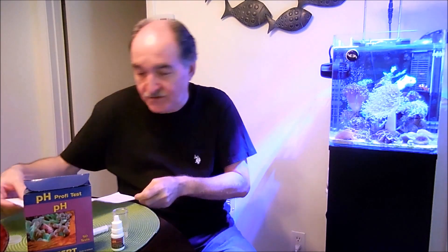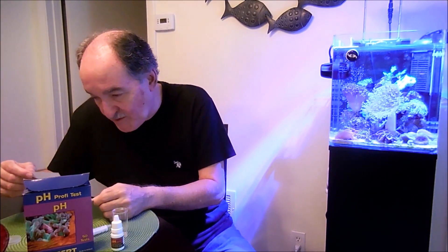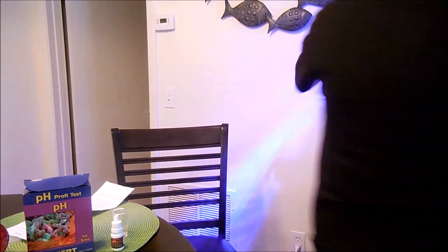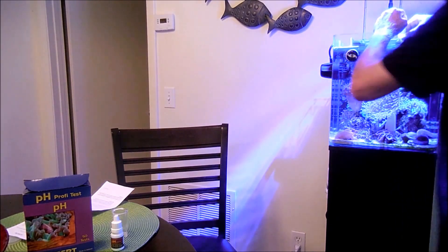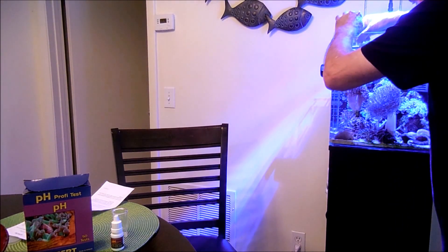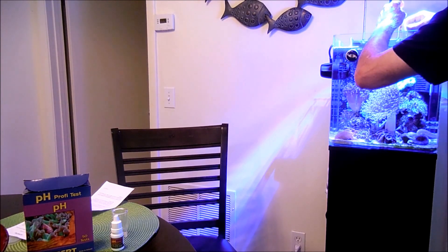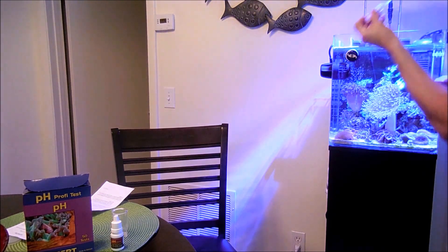So let's go with the instructions. First of all it says to fill the test vial with 5 ml of water. One thing that I like to do — I always flush it just in case there are any air bubbles. And here is the 5 ml of water.